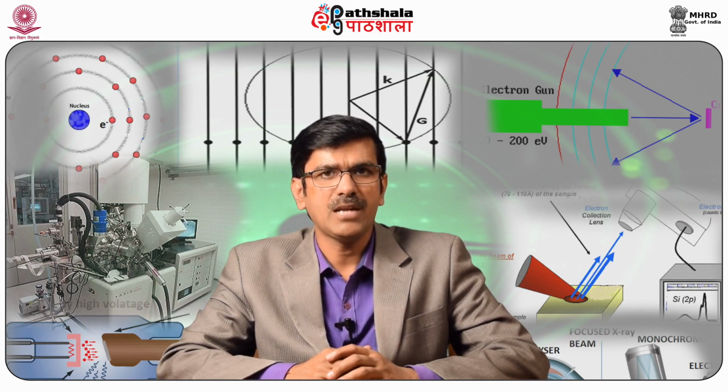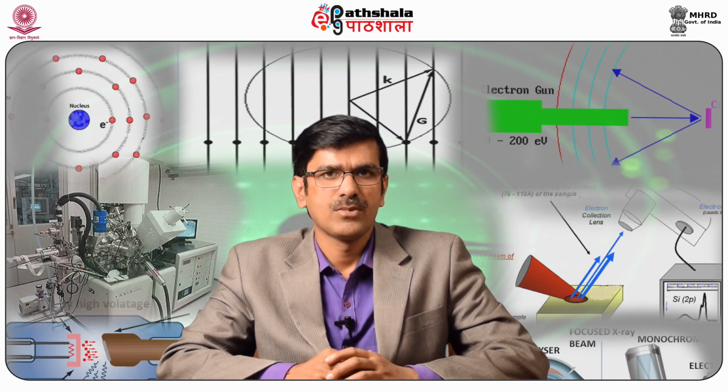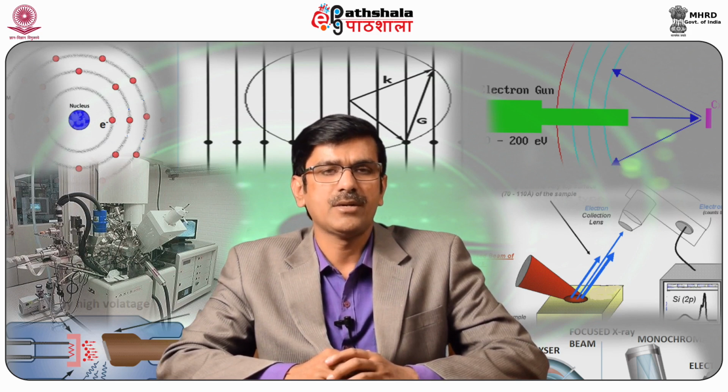High vacuum in XPS helps to remove contamination and prevents chemical reactions, and it also helps to increase the mean free path of electrons, ions and photons, because electrons scatter on gas molecules in the path from sample to analyzer. The mean free path is the average distance traveled by a moving particle such as an atom, a molecule, or a photon between successive collisions, which modify its direction or energy or other particle properties.